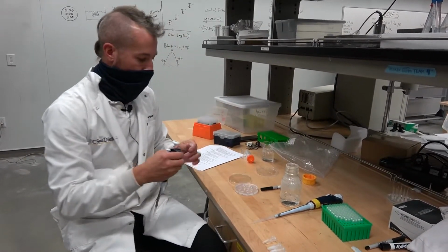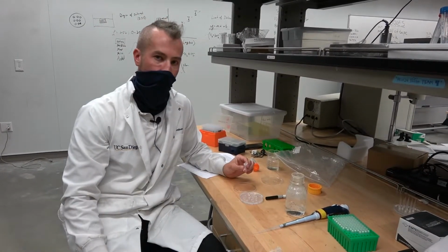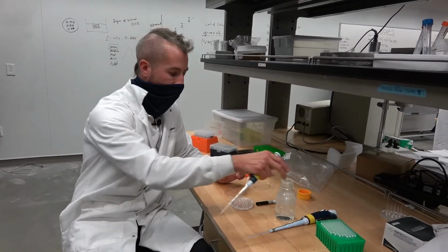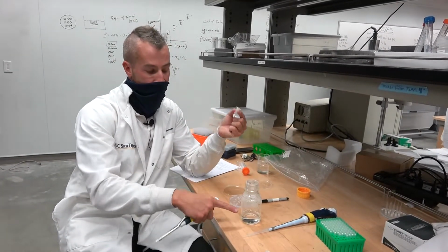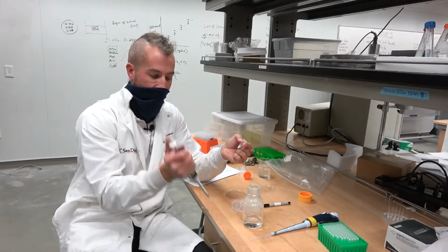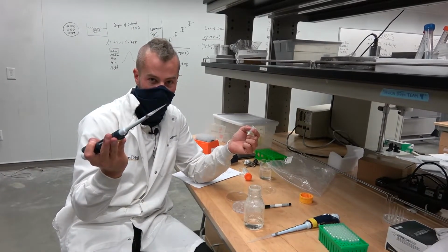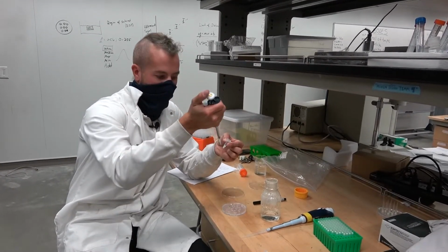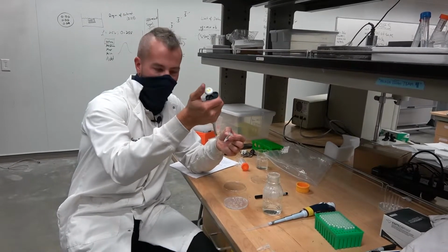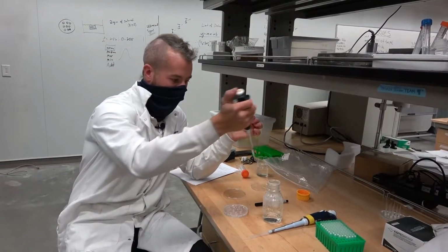So remember, this is 200 microliters. I'm going to mix it with another 200 microliters of hot agar. Now, this is room temperature, this is hot. As soon as I put this in there, the agar is going to start solidifying. I don't want it to solidify in my pipette tip, right? But I also want it to be mixed well, so you kind of have to do this process pretty quickly.